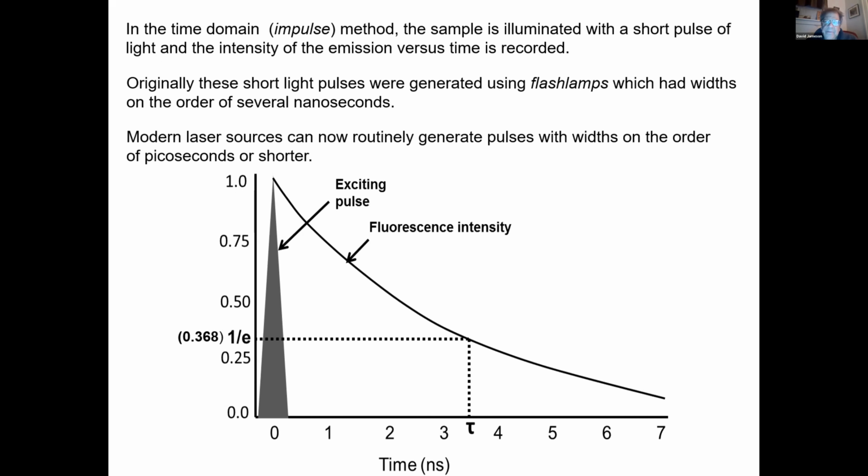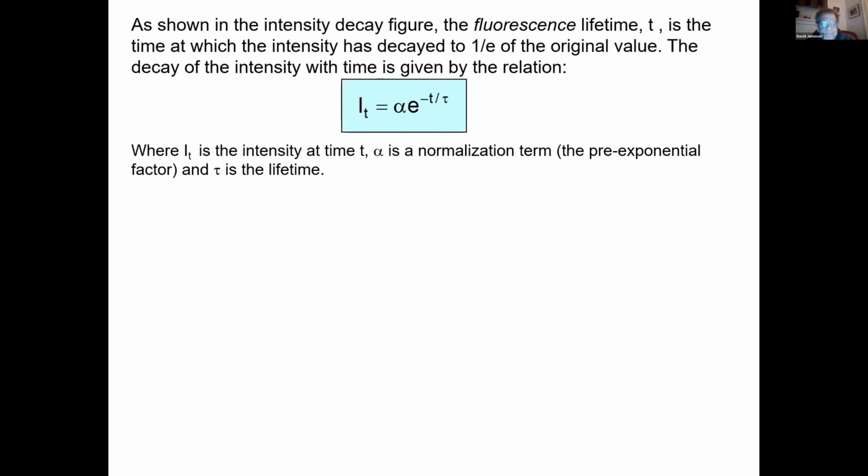And it's interesting because the only time you have to worry about deconvolving the pulse from the fluorescence is when you want to look at the very, very early times of the process. And I always remember Gregorio Weber telling me he was not interested in those early short times. He liked the public life of the fluorophores. He considered that the private life of the fluorophores, and he didn't want to go there. But nowadays people go there.